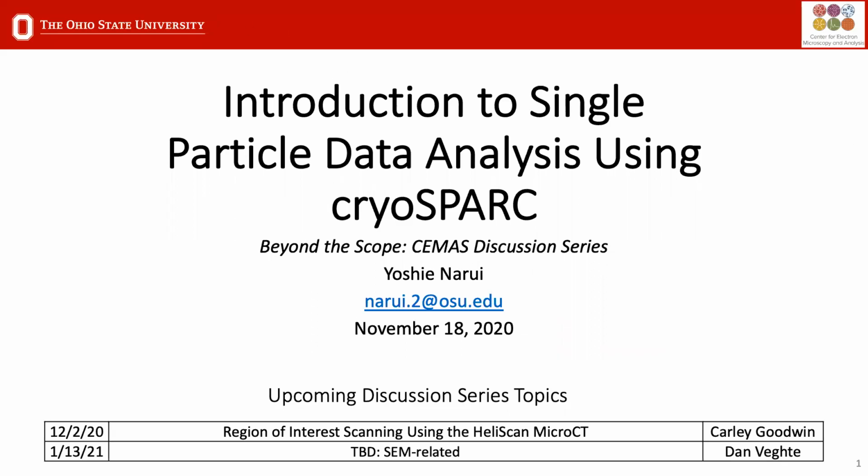Okay, I'll try and get to the questions at the end. I'm just going to go back to the first original workspace. If I want to look at the CTF results, it's not particularly exciting because it's very clean data. Just like with motion correction, it's calculating a CTF estimation all across the image. The defocus might be different across the image, but this image shows that it's very consistent. It will provide this information for the first 10 micrographs, I believe. Okay, so that's all pre-processing.